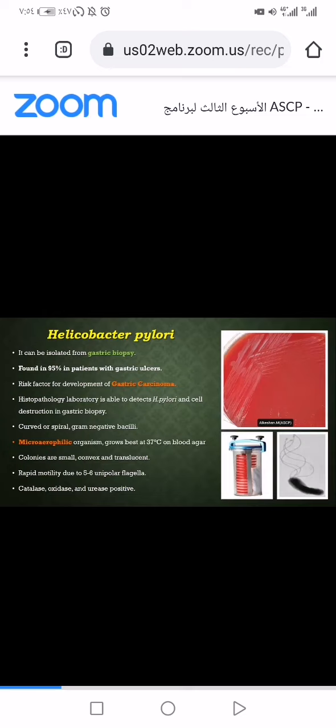So, before we talk about Helicobacter pylori, this thing here in the photo, we call it a jar. We put our specimens inside, like today, we have 5 surgical cultures for 5 different patients. So we have 5 anaerobic plates, okay? We have to put all of them in the anaerobic environment. So we can put all of them here, and before we close it, there is this bag. It can reduce the oxygen. You just open it and put it inside and close the jar.